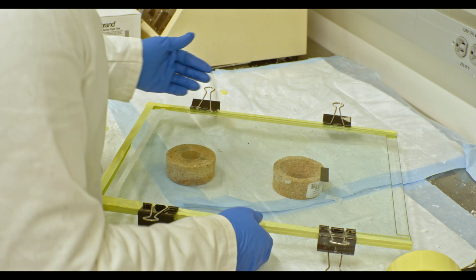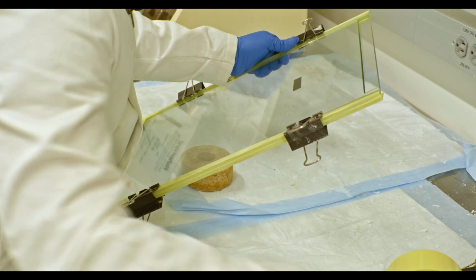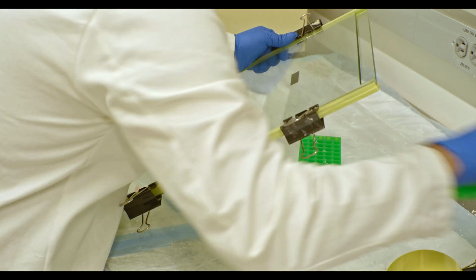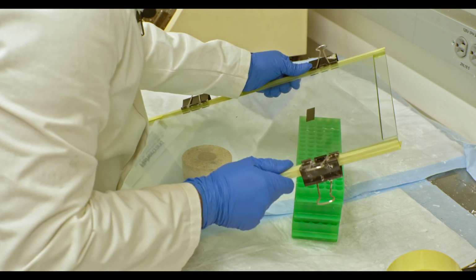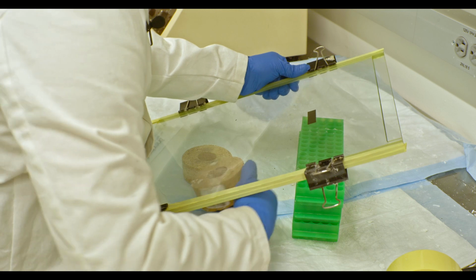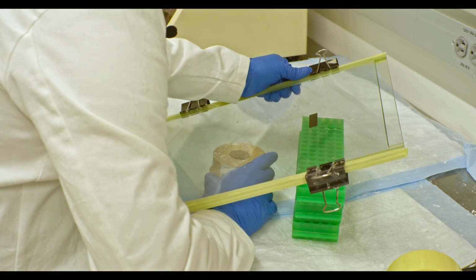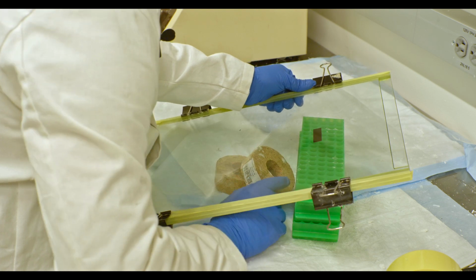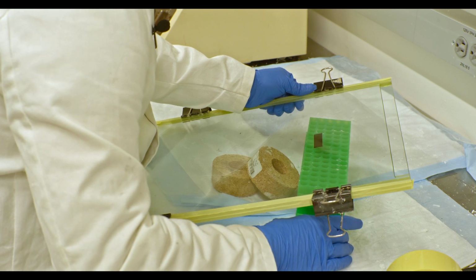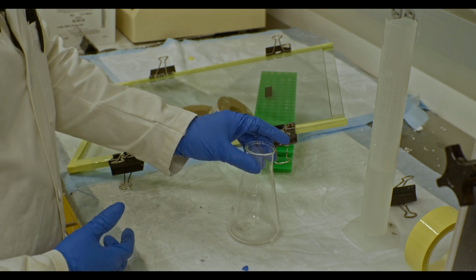Now, since most of the time you'll be doing this gel alone, the next thing that we've got to do is actually cast the gel. To do that, I usually take some of these microcentrifuge trays and place them right underneath the gel apparatus, and I try to balance it out and put it at an angle. This will make it easier for you to actually pour your gel solution down the gel. So now it's actually time to make the gel solution.